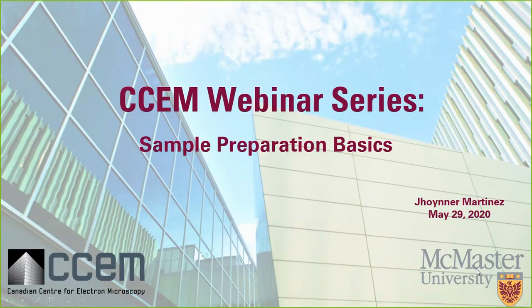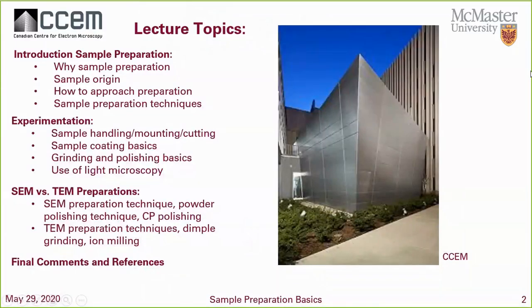So for today's lecture topics, I'm going to give a little bit of background on why it's important to do sample preparation, and some of the questions that we should ask about how to approach sample preparation, and how we come about finding the right techniques, right? We have to ask a couple of questions to understand where the sample comes from, because everything that we're going to do in terms of preparation will depend entirely on the sample. And then I'll give you some tips on what to think about in order to put it in the right microscope or for the appropriate application.